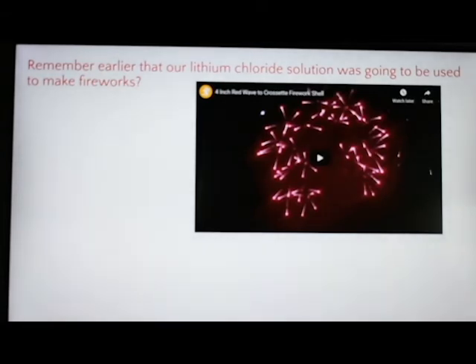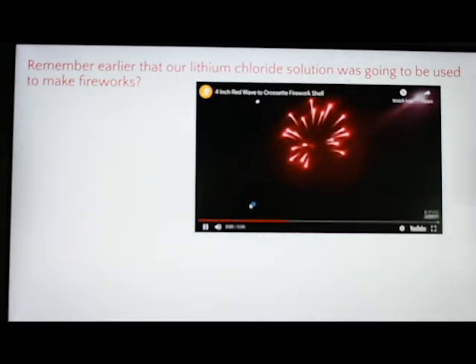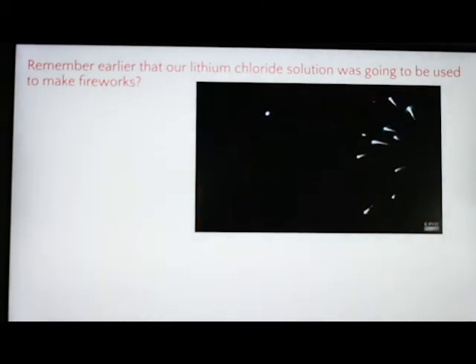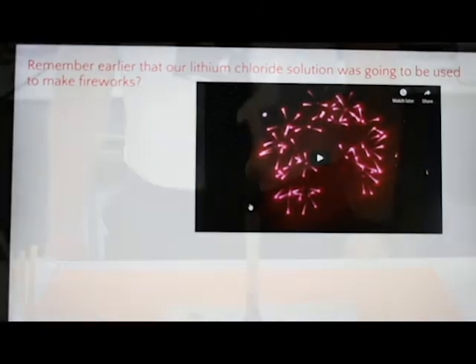You might remember that earlier I told you that lithium chloride solution was going to be used to make fireworks. Lithium chloride solution gives the red colour to fireworks. So we will heat a sample of solutions A and C in a Bunsen flame to try and work out which one gives us the red colour and is therefore lithium chloride solution.